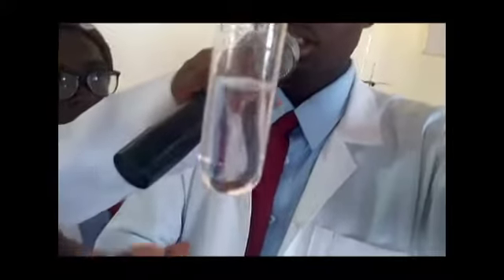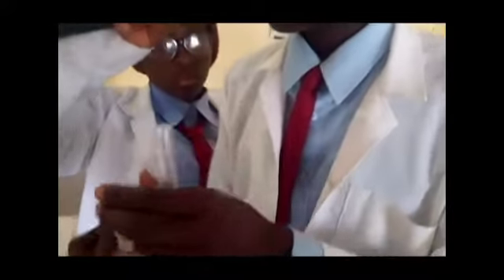The color that was in the test tube has disappeared. Another one can be production or absorption of heat. Now, this test tube, when I added the reagent, became very hot. That means the reaction was exothermic. Now the test tube feels cool, meaning the reaction is endothermic.